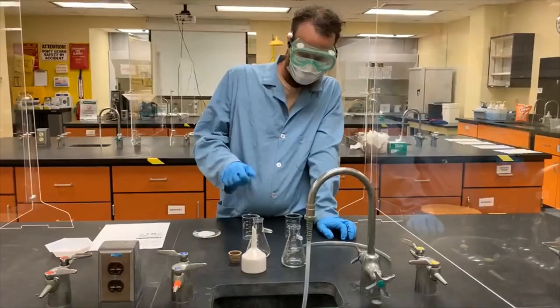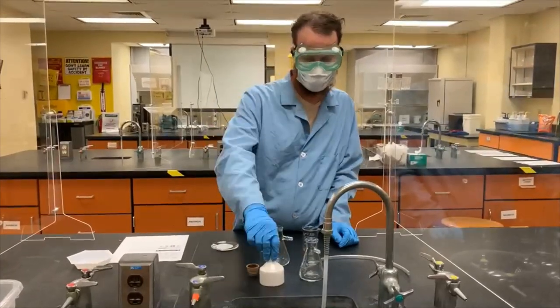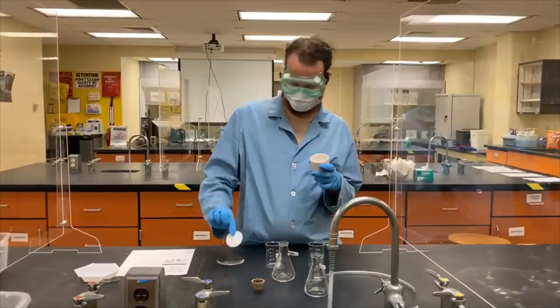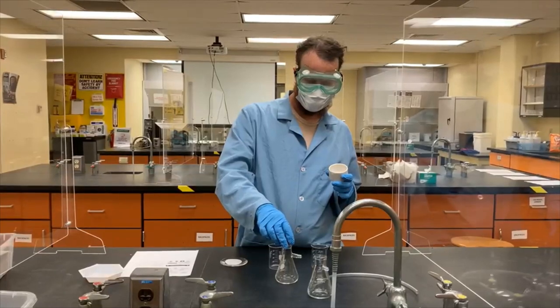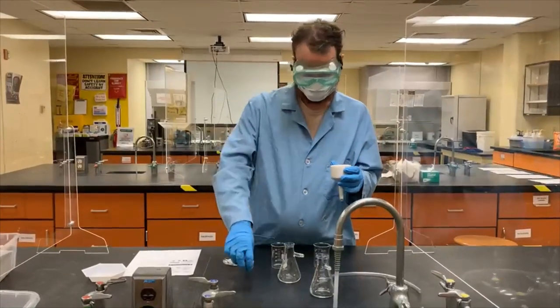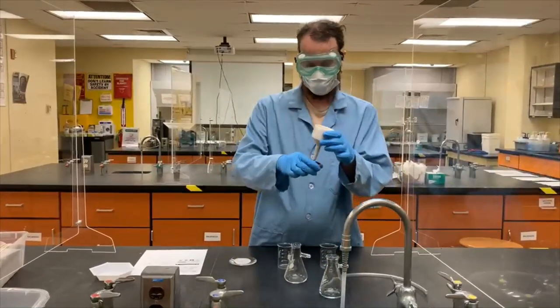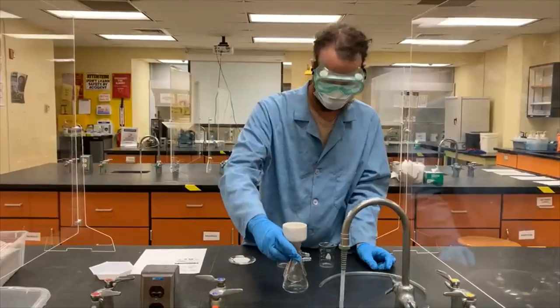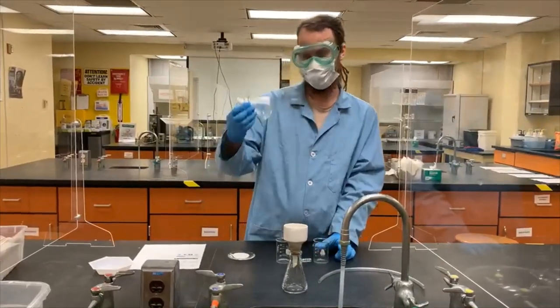A few pieces of the filter flask we need to set up here. So we have the flask itself, a funnel. We have our filter paper and a little rubber stopper to put at the lip of the funnel. And we have our vacuum source here. So first we set the stopper in the funnel and we set those up like that. And we have a second funnel, a second flask for later.